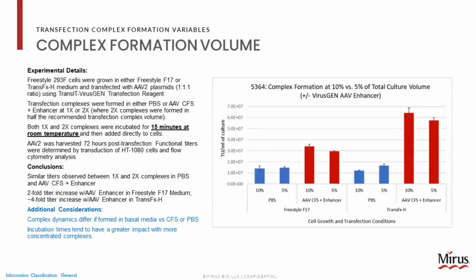So when we form complexes, one of the first questions is how much complex to make? What will be the total volume of complex? Mirus suggests for transfection that we would form the complex based on the total volume of culture, and that we would use 10% of that volume. So say we have 150 liters in our bioreactor. We would need to form a 15-liter complex. We can refer back to the sheet we provided earlier to get the numbers of exactly how much media, DNA, and reagent we would be using.